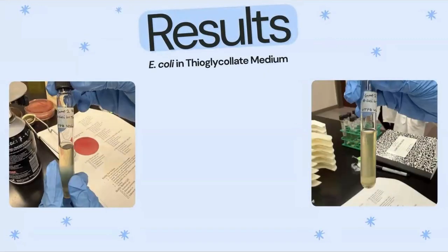When we look at our mediums, specifically the thioglycolate medium, the E. coli did experience some growth that appears cloudy at the bottom of the test tube. And so on the right side, we can see that this cloudiness was about an inch at the bottom of the test tube.